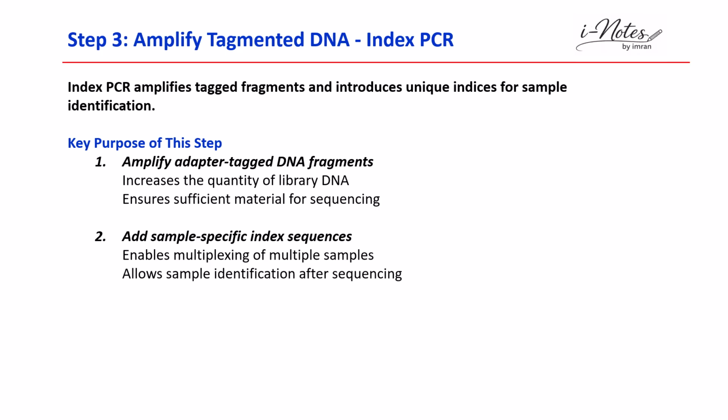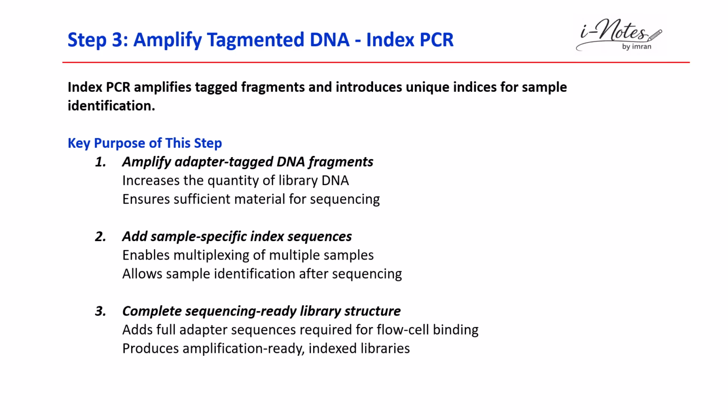and later, once the sequencing run is complete, during the analysis, using the sequences of the indexes, you can do the demultiplexing, that is, you can separate the data for each sample. And at the end of this process, you will have the sequencing library structure.